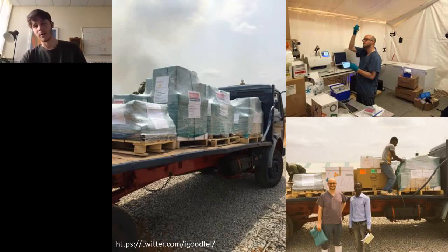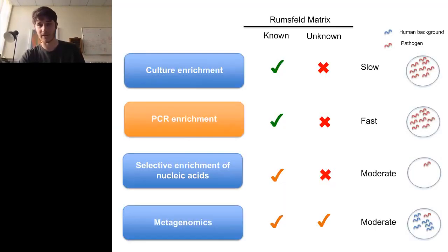And the equivalent setup for a conventional DNA sequencer, and by conventional I mean a benchtop instrument, which might be the size of a laser printer, required this amount of equipment from another group that were also sequencing and helping do surveillance sequencing in Sierra Leone instead of Guinea.